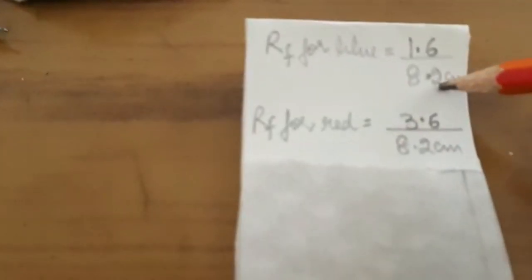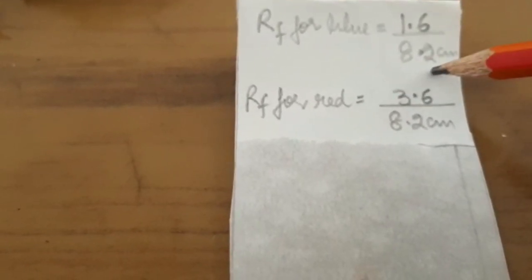I measure the distance to the center of the red spot and the center of the blue spot. The Rf factor — also called the retention factor or retardation factor — for blue ink is measured as the ratio of the distance moved by blue ink, which is 1.6 cm from the baseline, divided by the distance moved by the solvent front, which is 8.2 cm.